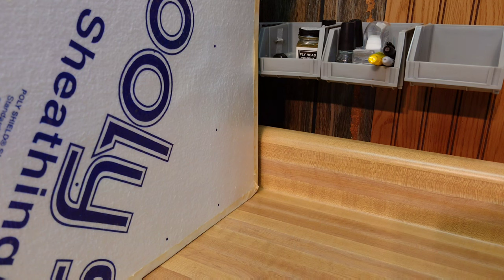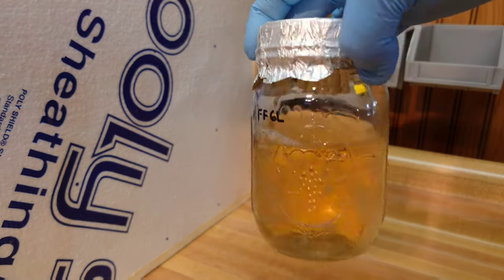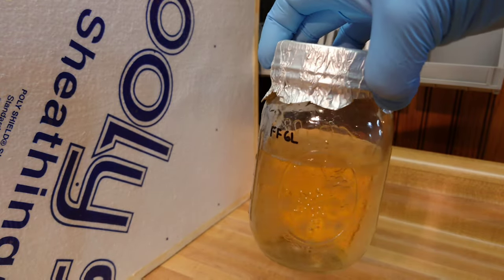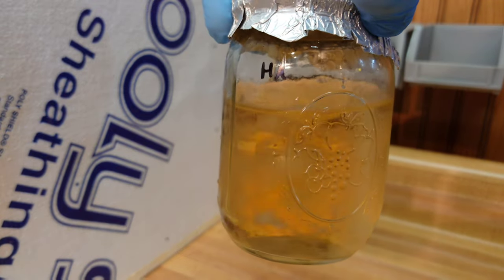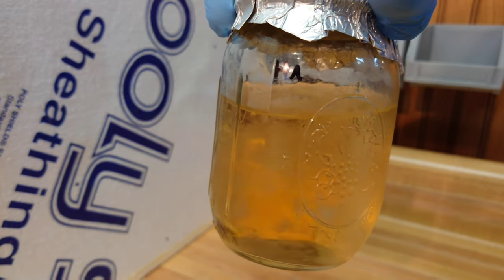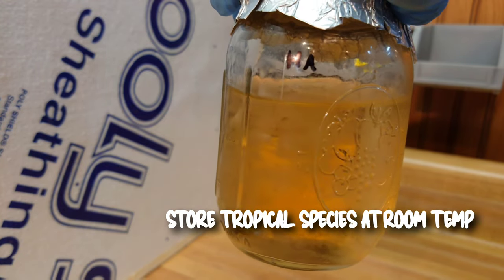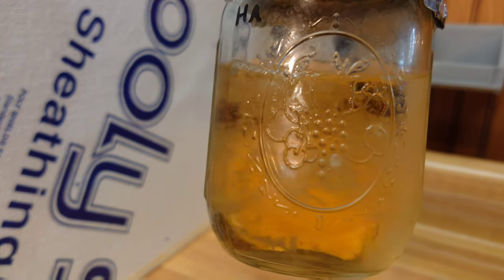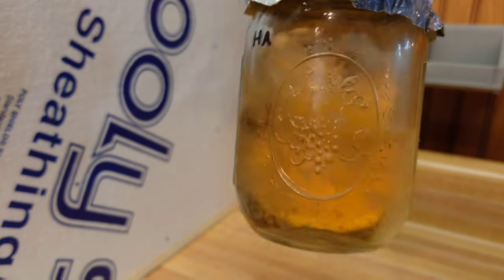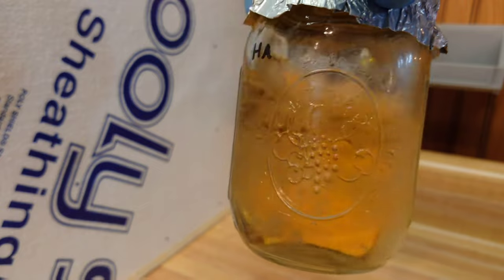Now let me show you what our liquid culture is looking like. Here's a direct-inject Ganoderma lucidum — pulled a syringe from the old jar, injected into the new jar, and this one will be ready to rock for another year. Here's our Hericium americanum, nice and chunky, looking perfect — this one's ready to go in the fridge. Usually when they get to this level of chunk they're ready to use. You can see the liquid itself is nice and clear. You don't want the actual liquid to be cloudy — this is amber in color because of the peptone, but it is clear and transparent. Cloudiness is usually a sign of bacterial contamination. You want nice clear nutrient broth with chunky mycelium.